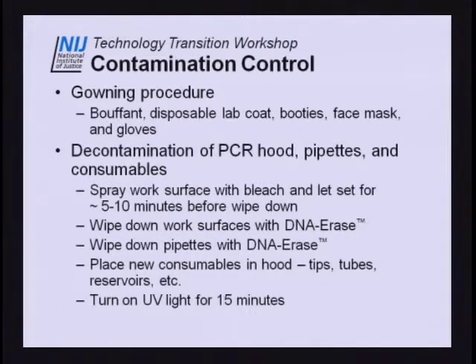We also actually use a sterile wipe that doesn't tear. It's a nylon base, so it's not as absorbent as a paper towel, but it has the advantage that if there's sharp edges and stuff, it won't shred and leave paper behind. And that's nice because we do these first two steps also on the Janus. We can't UV treat the Janus because it has tubing, and the UV light would degrade the tubing and cause problems.